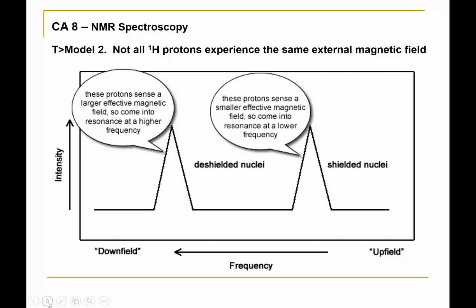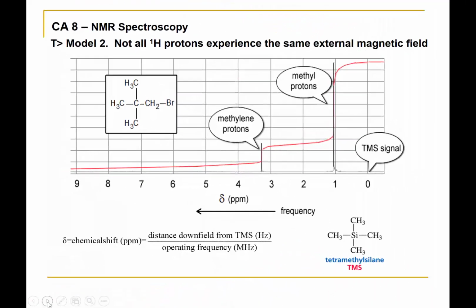I'd like to show you a simple but actual nuclear magnetic resonance spectrum. And this has to do with this simple haloalkane, the structure that's provided right here. As it turns out, that structure has two proton environments. The two proton environments we can show by labeling in the following way.